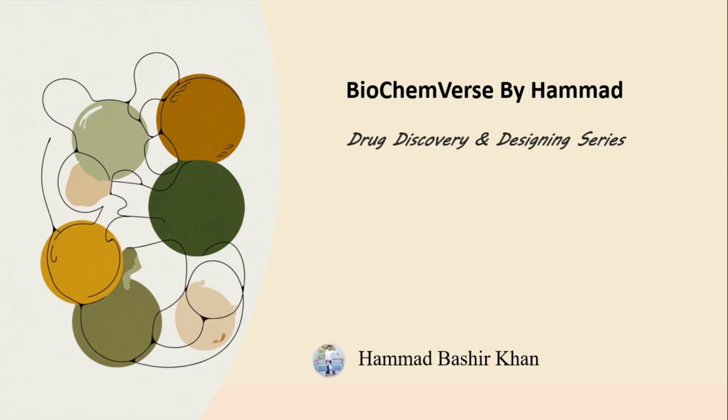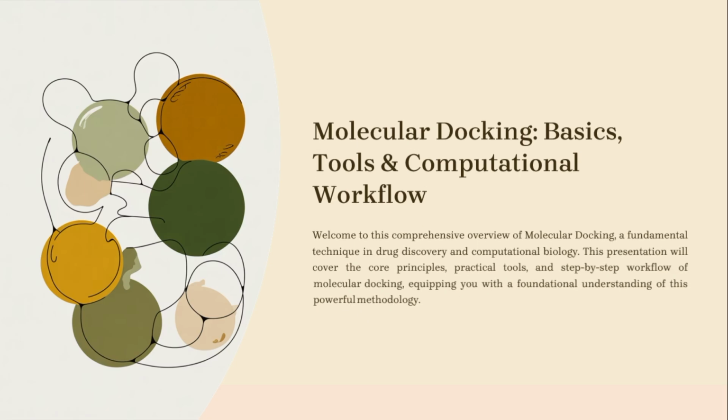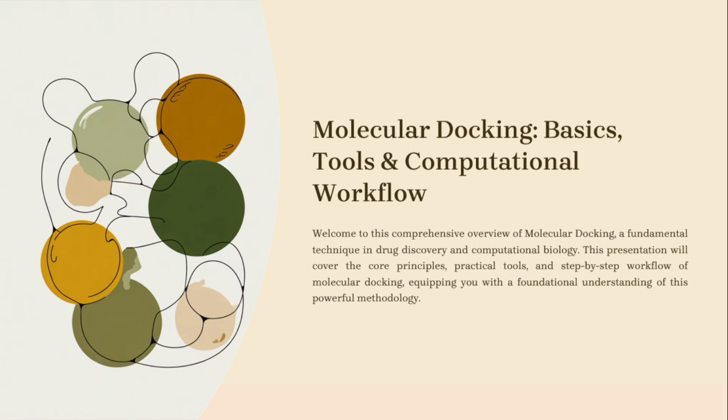So today's lecture is molecular docking basics, tools, and computational workflow. Today, we are going to walk through what molecular docking is, why it is used, and how to practically perform docking using commonly available tools and web servers.